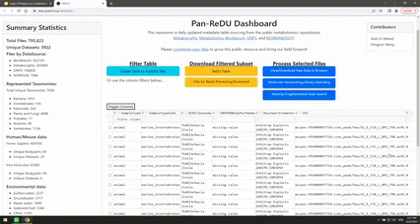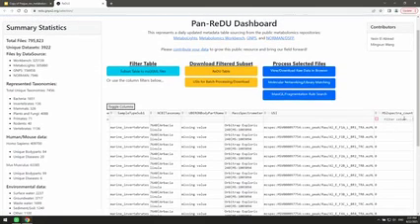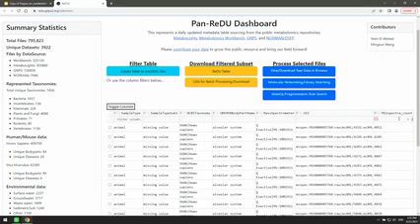Then go to the very left here, and I want some files that have more than 2 MS-MS scans, or basically any MS-MS scans. What I could do then is just select one of these files. Any, it doesn't matter which.